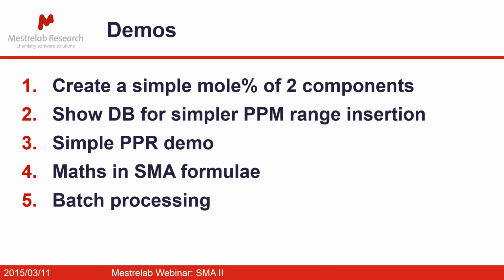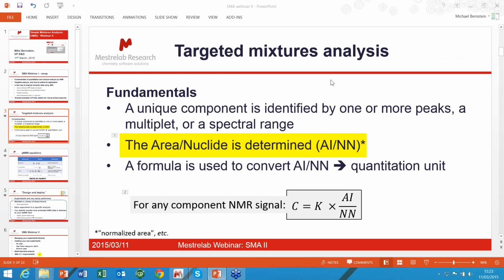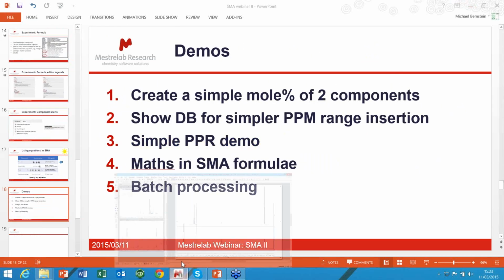So let's do some demos now. Get my notes out here. Okay, right, so I'm going to switch from PowerPoint to Mnova.